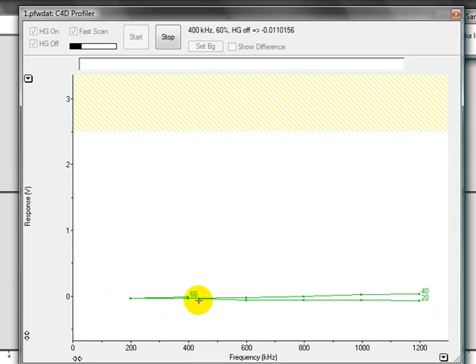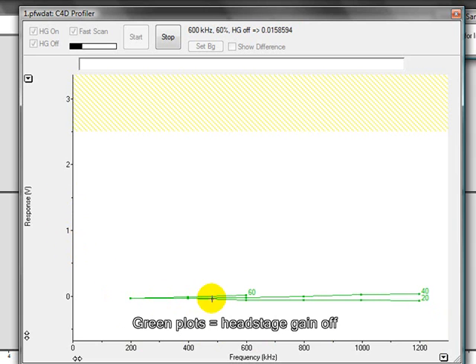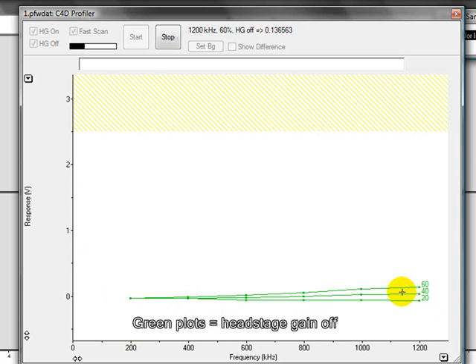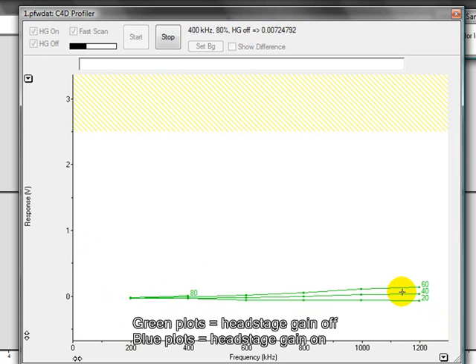It is starting with the head stage gain off, these are the green plots. Once it has finished those, it will run with the head stage gain on, these will be the blue plots.